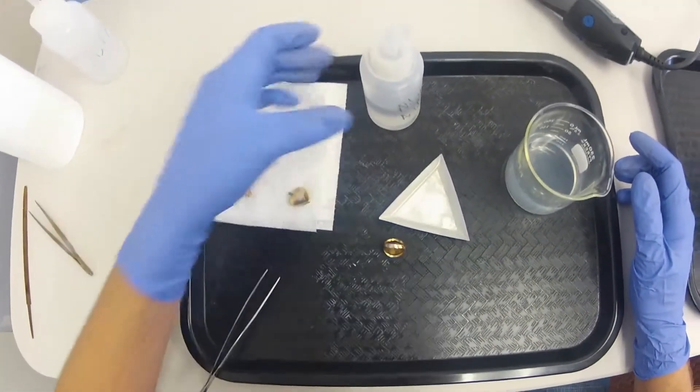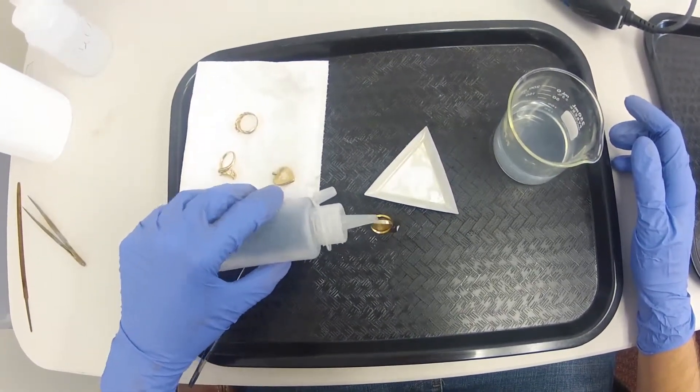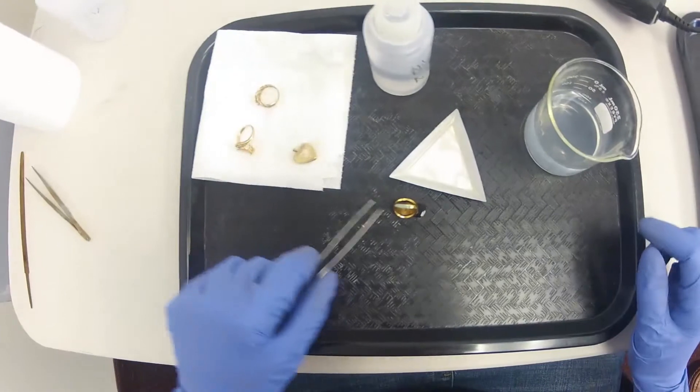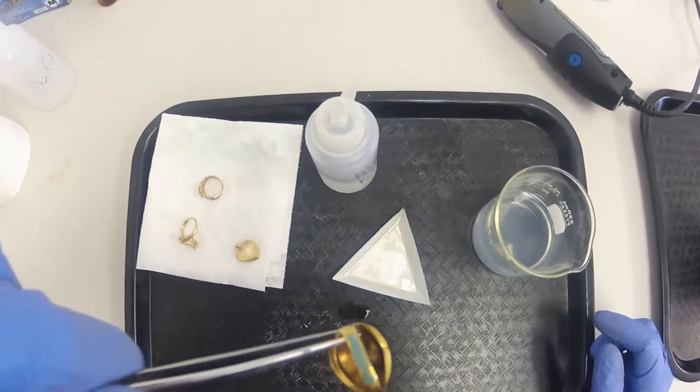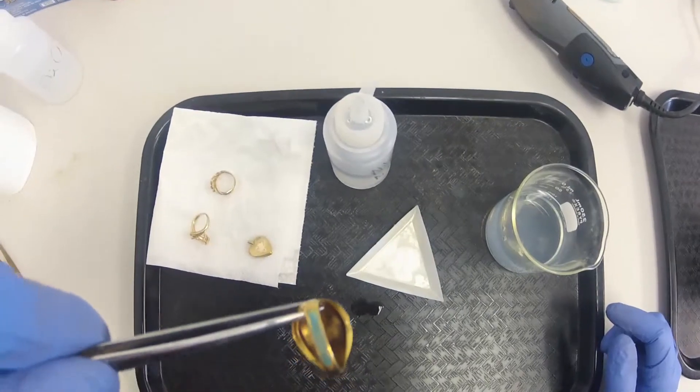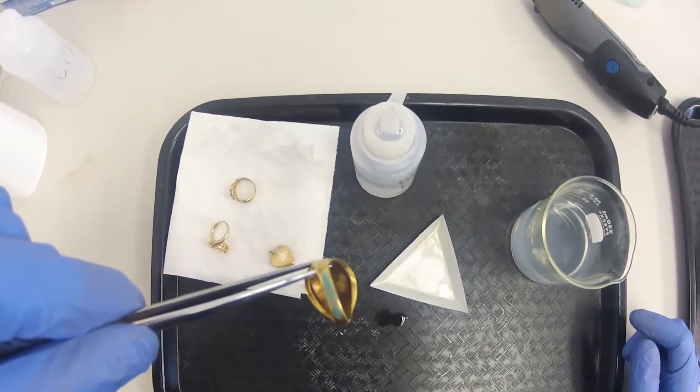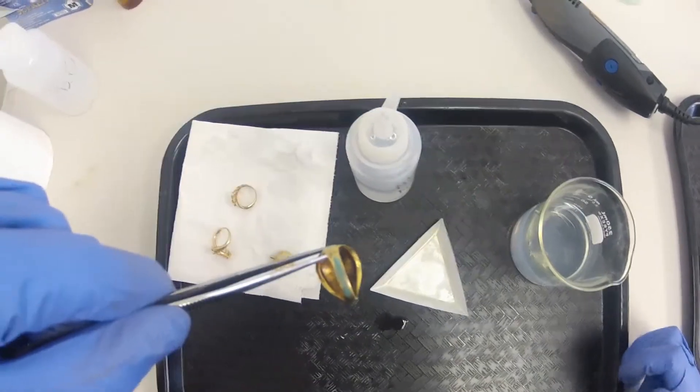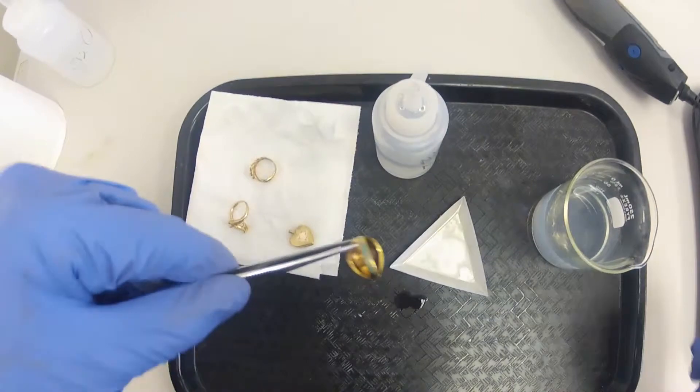So we'll take our piece here, put a little drop of acid on there. As you can see, it's foaming up really green right there, and that's because the copper is reacting with the nitric acid. The nitric is eating away the copper, and that's what that green color is there, that's copper.